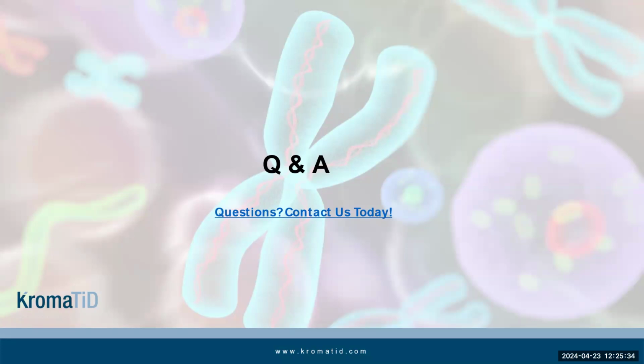And just to add to that, at this point, we've got pretty well-established quality control steps that take place at the bench. When the analog incorporation is overshot or undershot a little bit, there are specific visual characteristics of the cells that are very easy to spot and we're very familiar with.